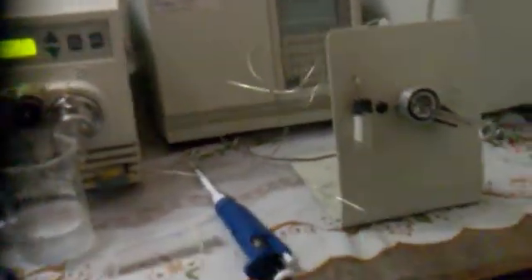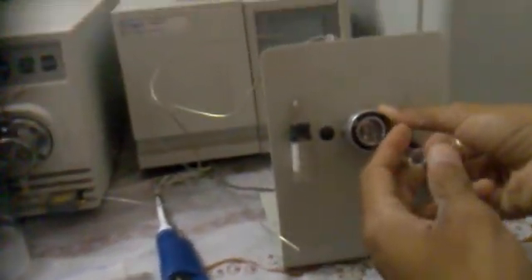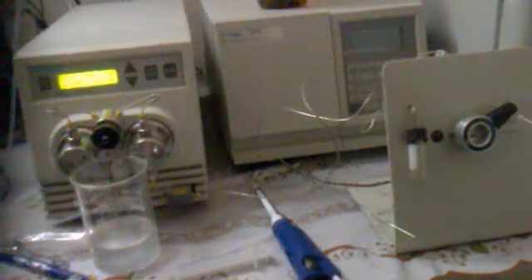This reading continues once the complete run is over after the fixed run time. We will again bring this Rheodyne injector back to load position, remove the syringe, take a fresh sample, load it again, and then go for injection mode as before.